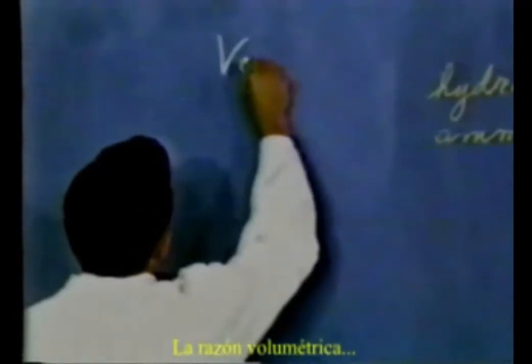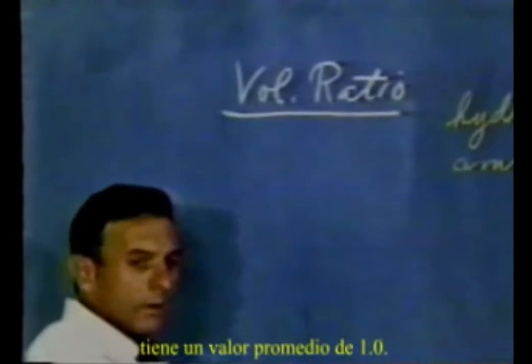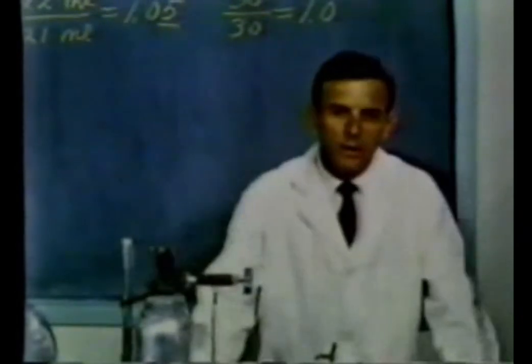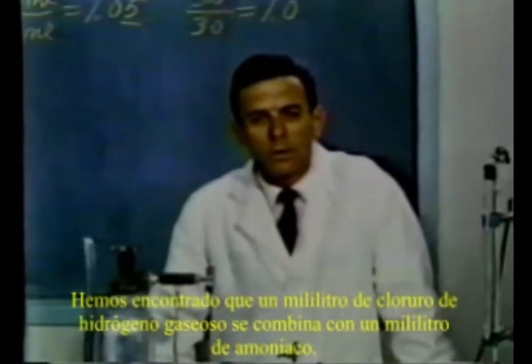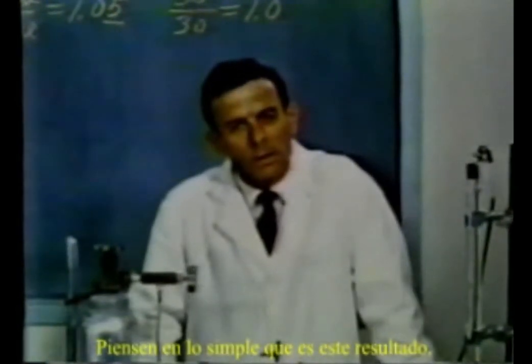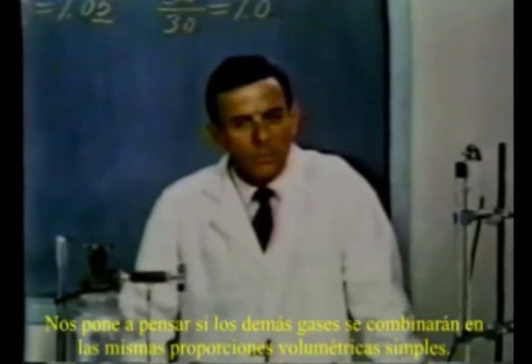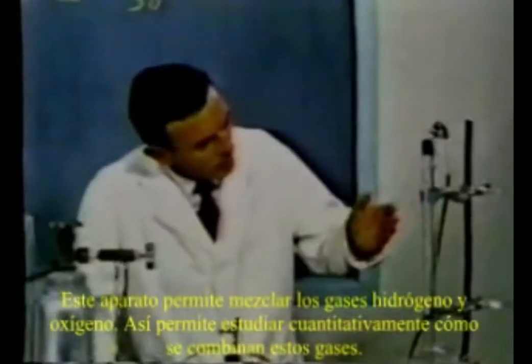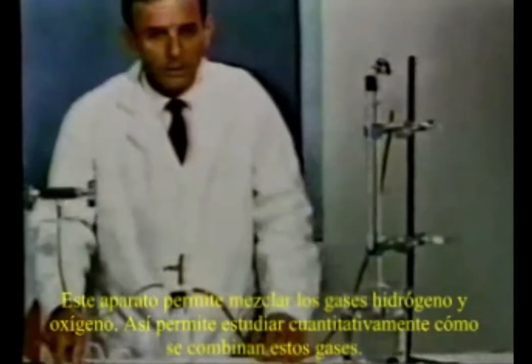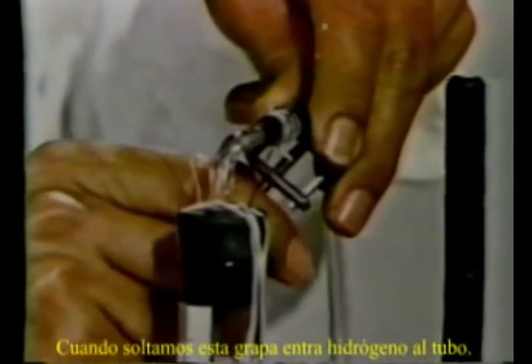The volume ratio is, on the average, 1.0. We have found that 1 milliliter of hydrogen chloride gas combines with just 1 milliliter of ammonia. Think what a simple result this is. It could lead us to wonder whether other gases combine in the same simple volume ratio. This apparatus permits us to mix hydrogen and oxygen and study quantitatively how these gases combine. When we loosen this clamp, hydrogen enters the tube.